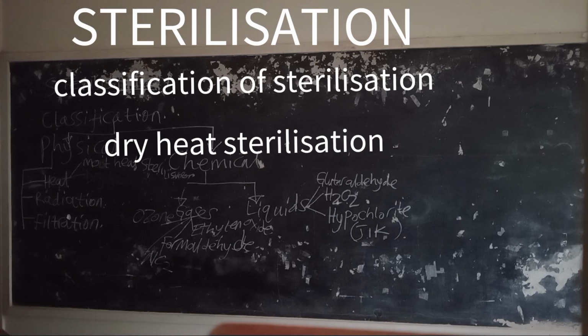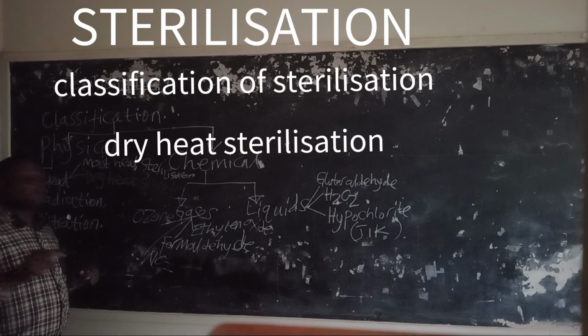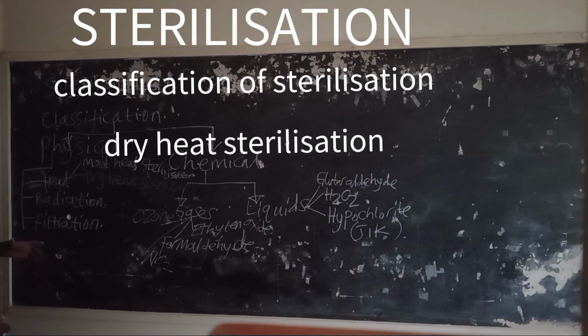So are you getting me? Are you getting it? So this is it, moist heat sterilization, dry heat sterilization, that is under heat sterilization.